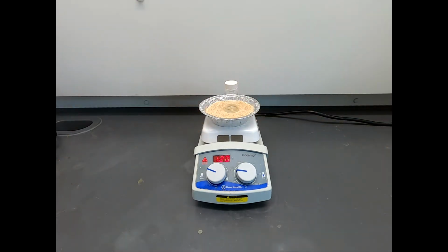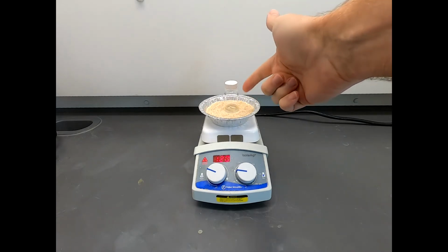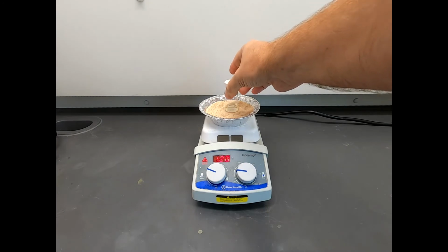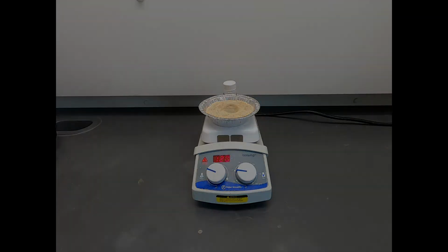And then once everything is dissolved, we will add our anhydride to this mixture, and then we'll actually sink it into the sand so we get the full effect of the heat. But I don't want to cook this yet. I just want it to gently warm, and so we'll just place it on top of the surface of the sand bath, and that should be more than adequate to get dissolving. So let's wait a couple minutes, let this dissolve, and then we'll add our last reagent, the anhydride. This is cycloadduct from a previous reaction, and we will get this reaction started.